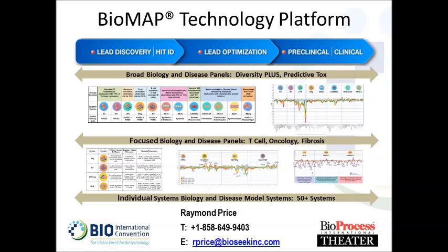Right, yeah, that's right. So this was selected a little bit for simplicity, this is only about 45 or 50 of the molecules that we profiled, but you certainly can do that as well, looking at structurally diverse molecules, looking at target selectivity or on-target, off-target activities.